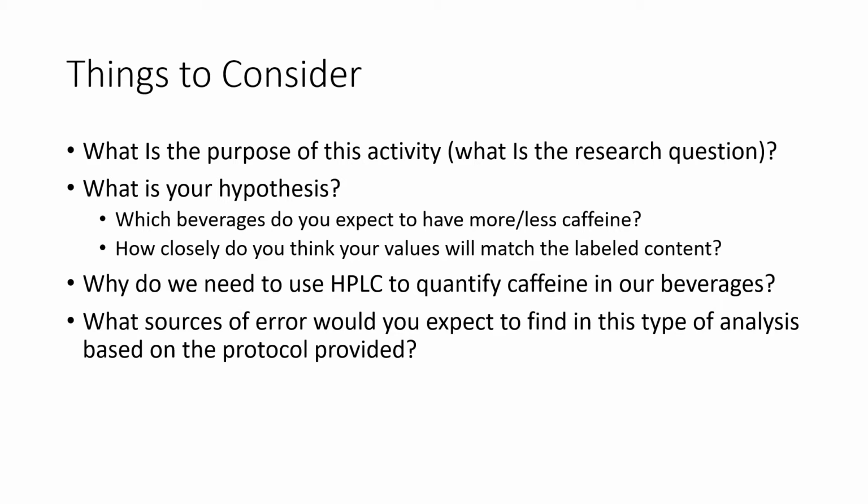And then, of course, what sources of error would you expect to find in this type of analysis based on the protocol provided? So this is actually a quantitative method. We're taking a raw sample, separating out our compounds and quantifying that unknown based on a calibration curve. So there are a lot of different preparatory steps that can lead to error in our final result. And that comes from sample prep and goes through to our data analysis and how we present that data. So think about that both through this pre-lab discussion as well as one of your lab questions.